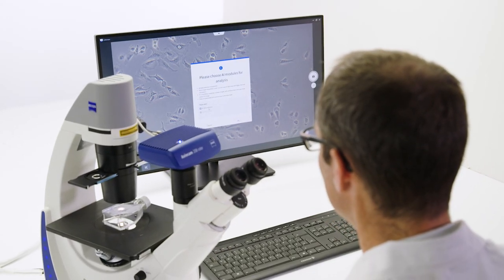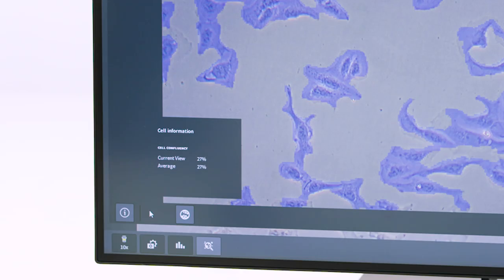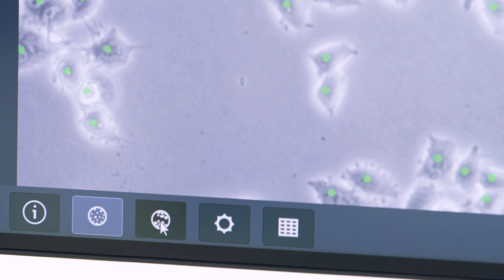Opt for the Zeiss LabScope AI cell confluency module and start to improve the quality of your cell culture today. Make your experiments more reproducible.